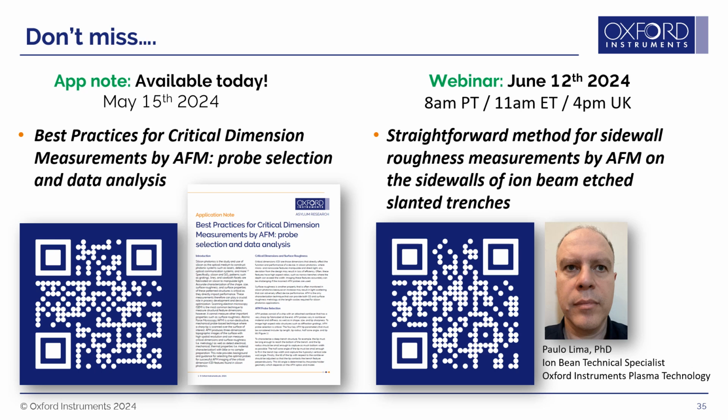Right. So in terms of tapping mode imaging, this is a little bit less important than it would be if the imaging mode were fast force mapping or just performing force curves on a sample. There you would have to really think of how stiff your sample is versus your cantilever, and then you would want your spring constant to be high so that you're measuring the deformation of the surface and not your cantilever.